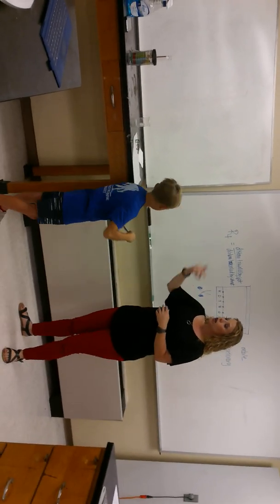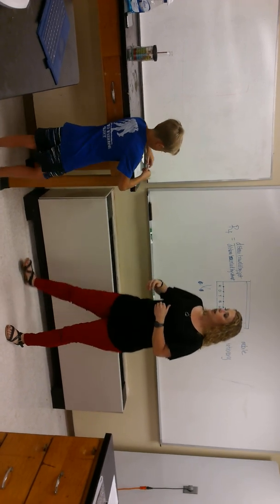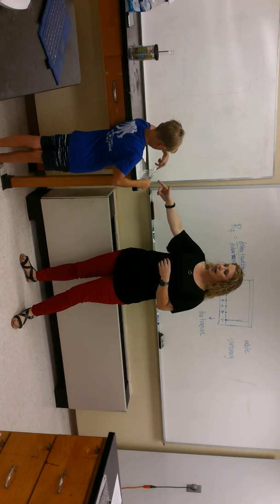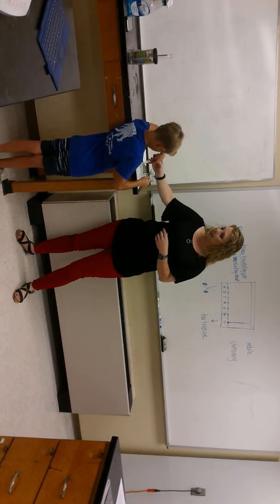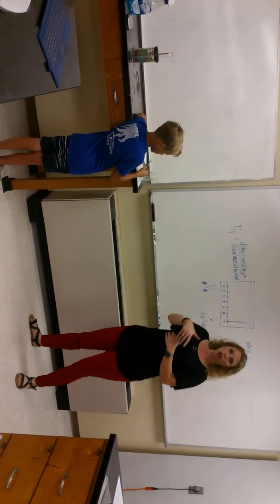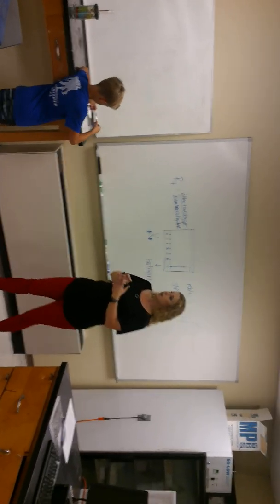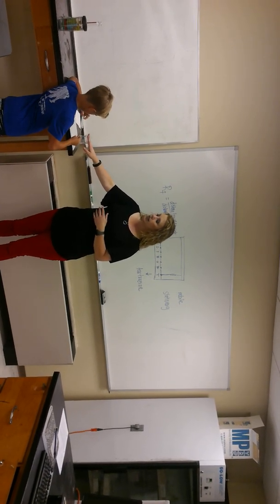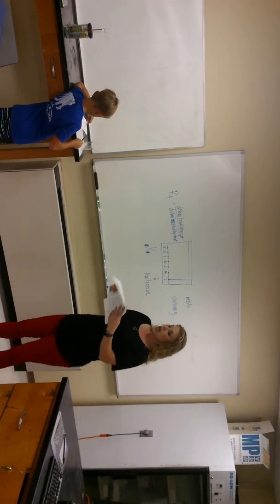That's right. So what I suggest is that we get a waste beaker. That's right. And that we do what? We pour our solution into the waste beaker, and when we do that, the yarn will kind of come down. If it doesn't, we very lightly tap the test tube onto a paper towel, and the yarn will either come out or it will come far enough down that you can pull it out with the tweezers. Okay? All right, so once you're done with that first waste beaker of acetic acid that you got the dye off with, you can put that down the sink, no problem.